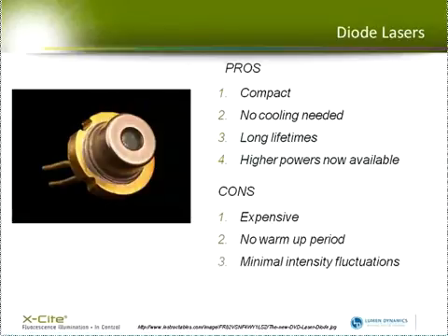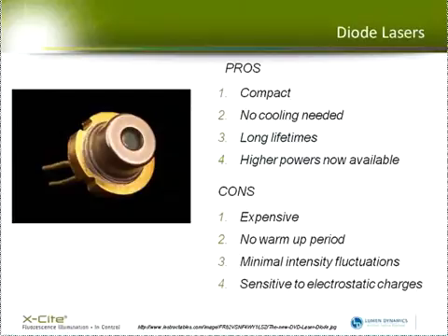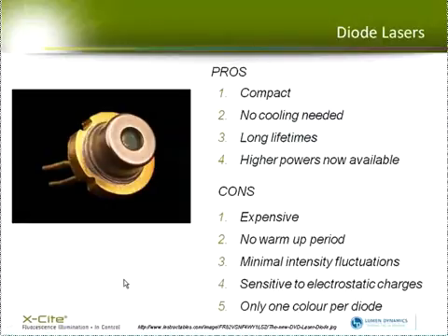There's no warm-up period, again, when they're turned on, they're on, and there's minimal intensity fluctuations. They are sensitive to electrostatic charges, so you have to be careful you don't destroy it by giving the system a shock. And as I said, there's only one color per diode, so if you want to do multicolor imaging, you need to buy multiple diode lasers.